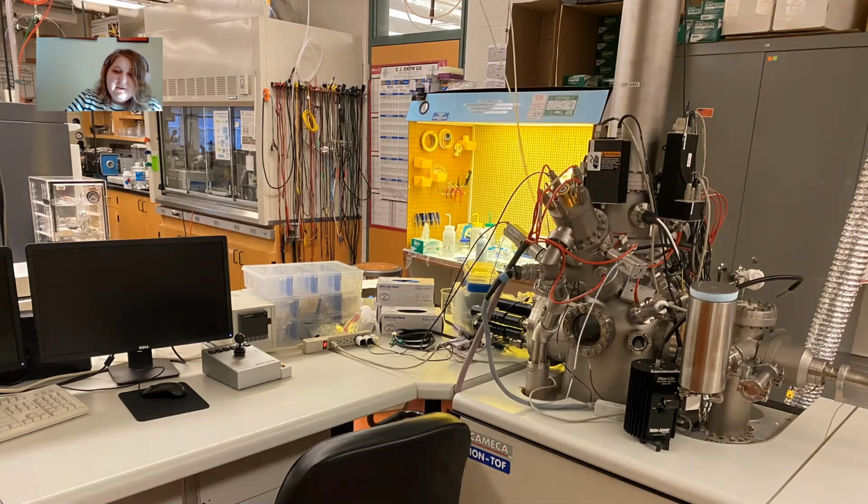So I have a few pictures here of the TOF-SIMS that we have. It's on this sort of desk setup. Here on the left are the computers that we use, where you can control the parameters of the instrument. There's a joystick where you can move the sample holder around. And then here you can see the vertical chamber where the ions travel up and then down, and you can get the time of flight. This all happens under vacuum. This is the vacuum chamber, and it has to be under vacuum so that the ions can travel unimpeded.